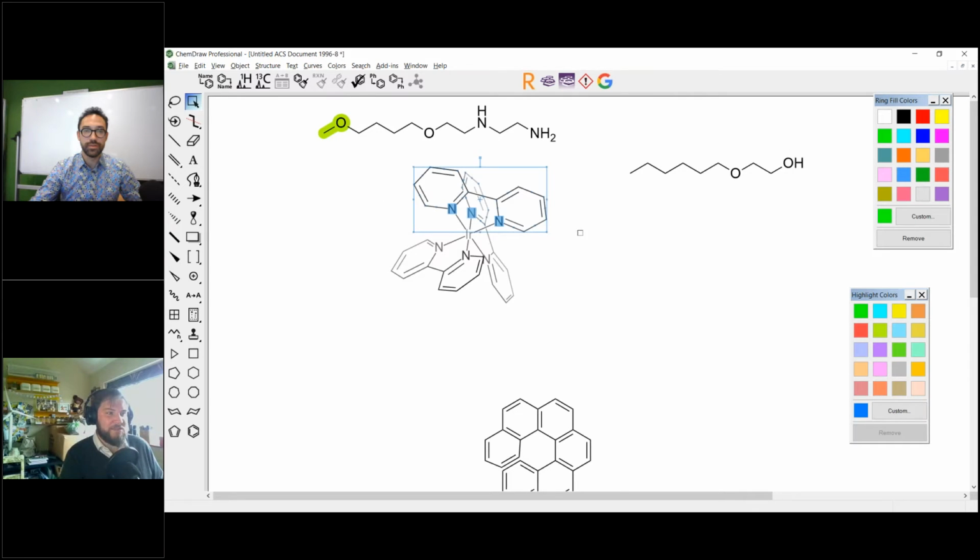Let's have one last quick question. Can you use from a chemical structure, can you predict or estimate what NMR data might be? Oh, yes, absolutely. That's been a feature around for a while.